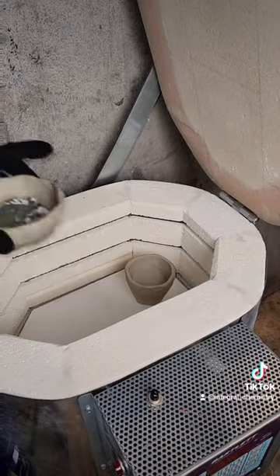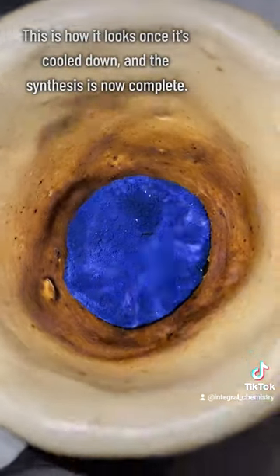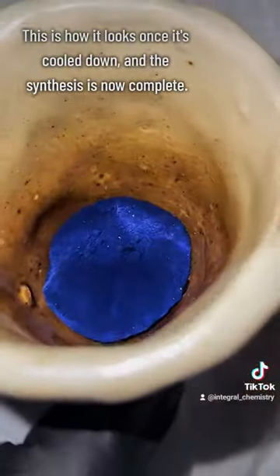I give the kiln a day to cool down, and when I come back, this is what my YIN-MN Blue looks like, and my synthesis is now complete.